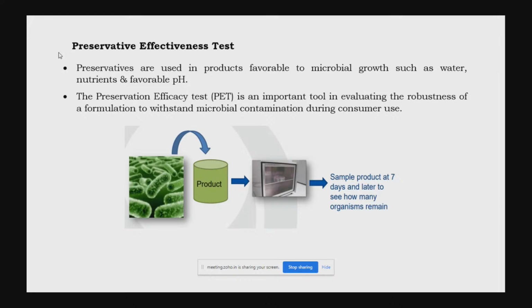In that condition, due to the preservatives, the product was not contaminated with external microorganisms, and for that purpose we need to perform the preservative efficacy test. In the preservative efficacy test, we challenge the product with multiple microorganisms at 10 to the power of 6, and we incubate the drug product along with the microorganisms at 37 degrees centigrade.